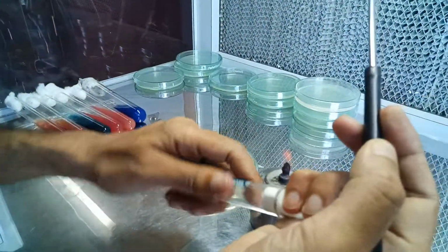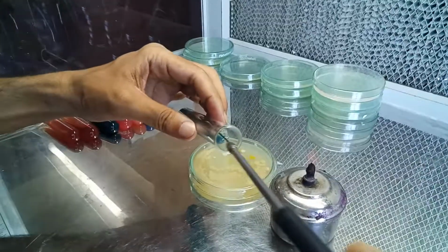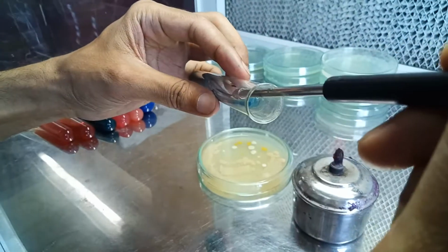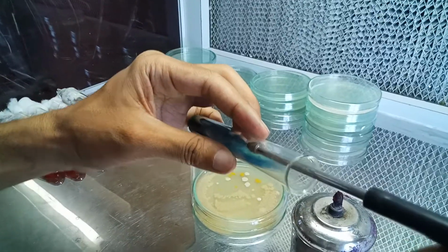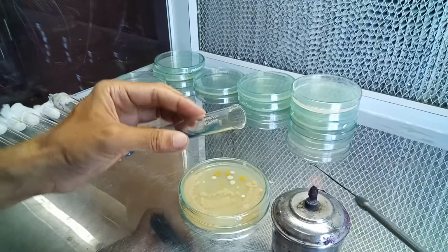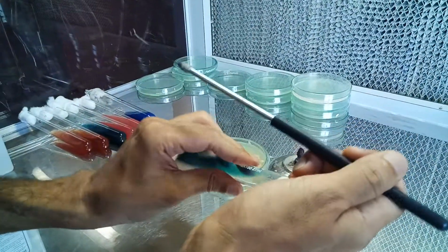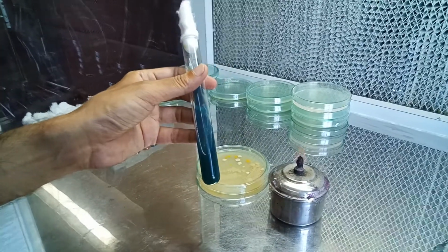And then we will take the tube, we will heat it near the burner, and first of all we need to stab it. So we need to put it inside. If you can see, it goes inside, and then we will have to make a continuous streak. And then close the tube, and we will have to now incubate it at 37 degrees centigrade for 24 hours.